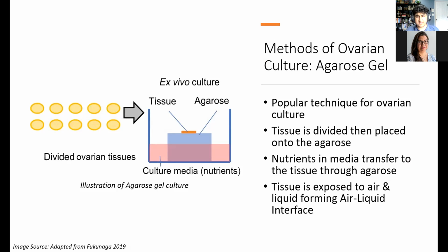But what's special about this culture? Why is it widely used? And that's because it forms an air-liquid interface. The tissue is both exposed to the air and liquid.